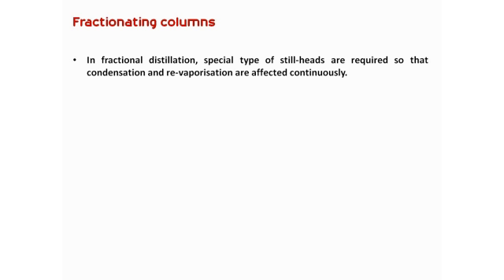If we just recapitulate the thing we have discussed in the previous presentation in part 6, we discussed how the liquid first gets vaporized, again gets condensed, again gets vaporized, so that we can separate out the mixture of the components based on their difference in the boiling point.